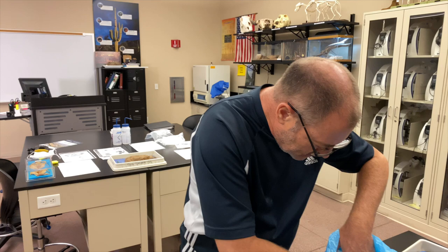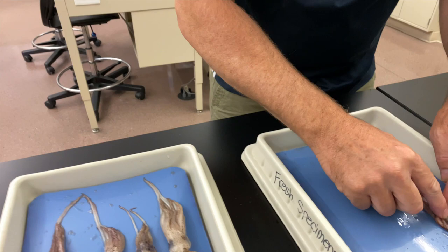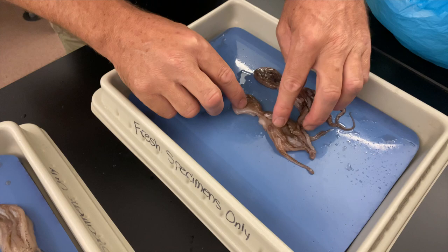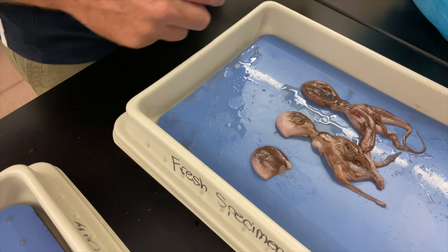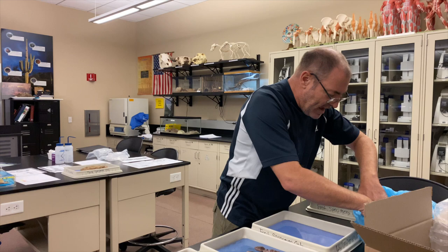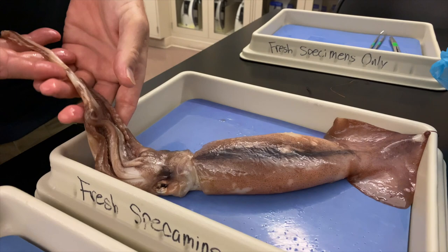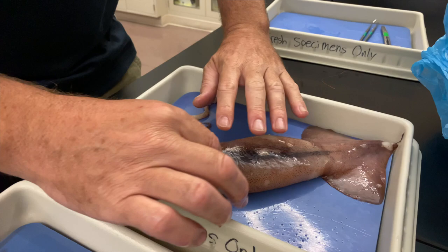What do we got in here? Yes, there's more. And we got these little cute ones — they look like little babies, but they're not, they're full-grown. Okay, and this one literally lost its head. The packaging was done very well, they were all packed very nicely. Look at this bad boy — too big to even fit in the tray. Awesome.